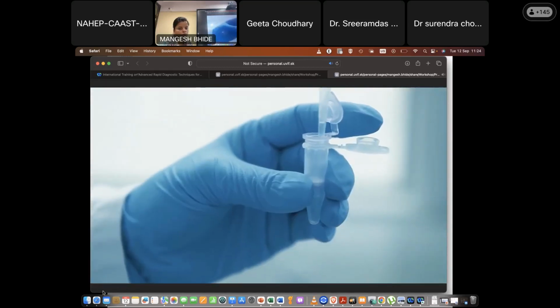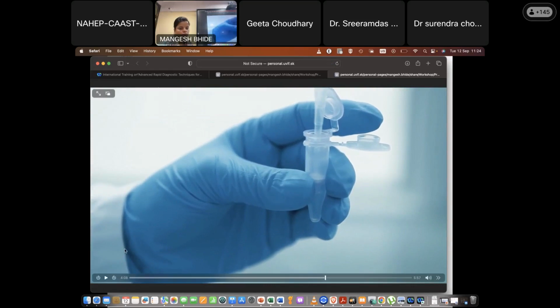Okay, so in the washing step, there are two things. The first one is the concentration of ethanol. You have to have ethanol in your washing, because do you know what membrane this is? What kind of membrane is this? Okay, so this is silica type B. This is silica, but it is type B.